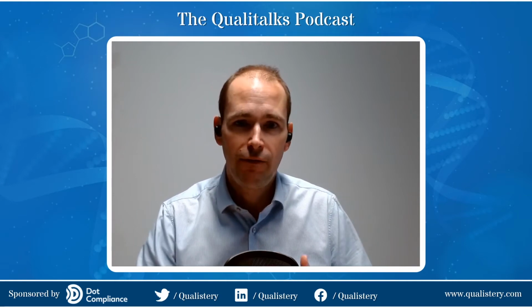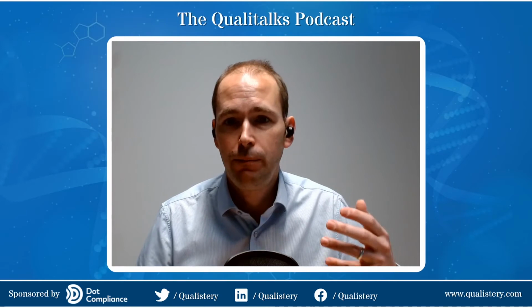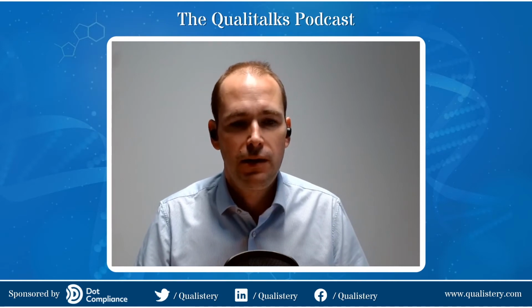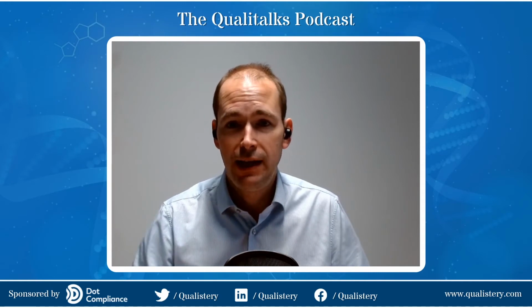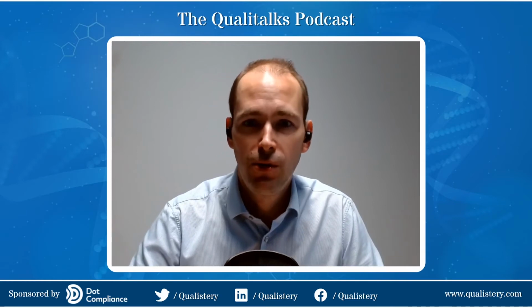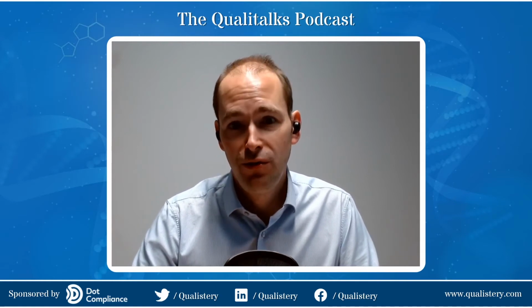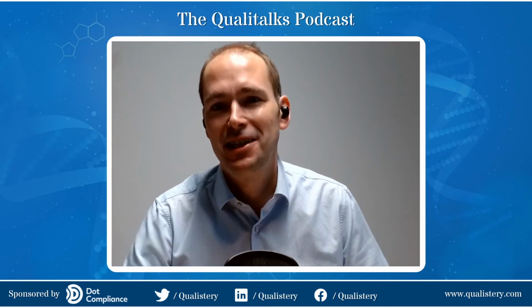So that would be looking at vacuum pulses, at any additional drying cycle that we can add, any overpressure. So that might be putting additional services onto the autoclave, like hot air or compressed air. It might be having cooling water to the autoclave, just to enable us to cool loads, to remove air, and to dry loads. So it's something that's very difficult to retrofit. So we can do that at the URS stage because we can anticipate it, I think.